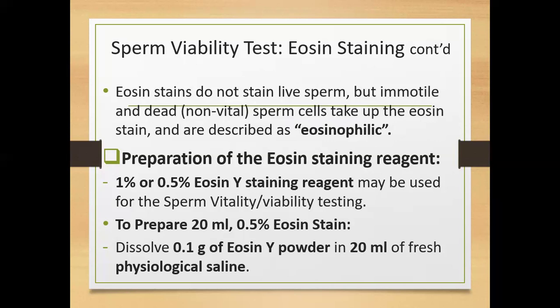All right, that's good. So 1% means 1 gram in 100 ml of water. This applies if the substance is solid. If it's solid, you weigh 1 gram. If you are dealing with a substance that is a liquid, then 1% means 1 ml in 100 ml. That is also very important to note. So with this one, 1% means 1 gram in 100 ml.